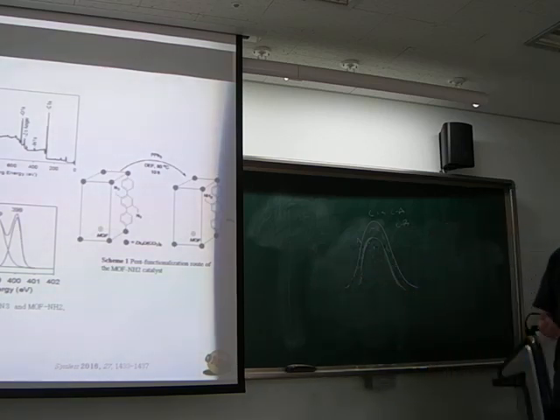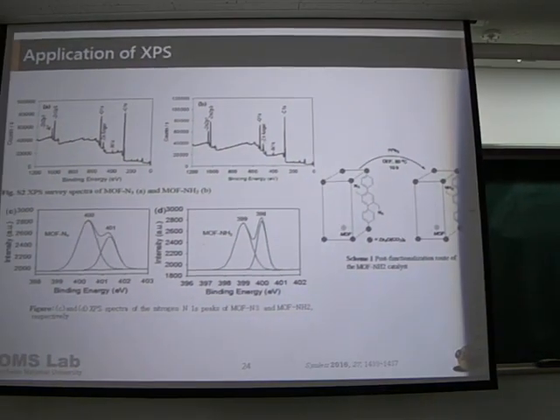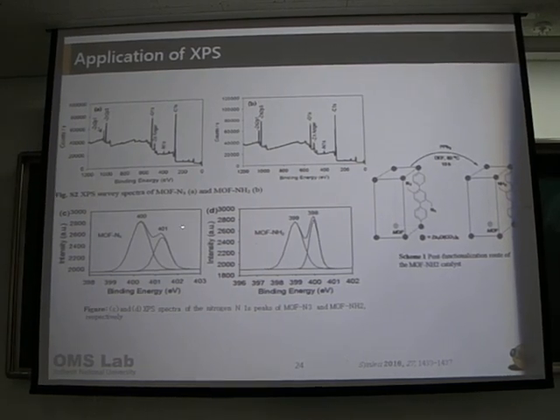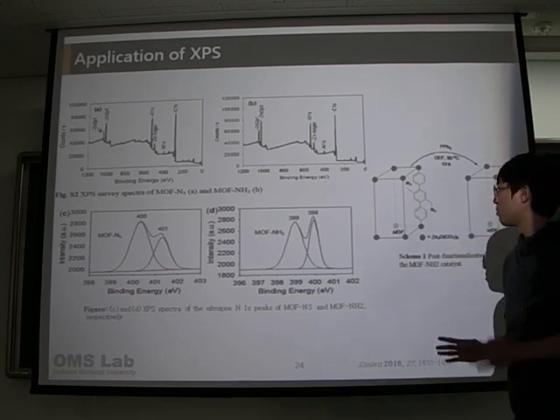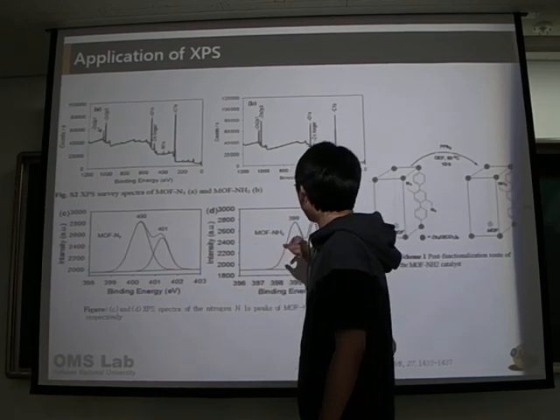그러면 NMR에서 우리가 인테그랄에서 10% 에러를 무시하는 것처럼, XPS에서는 어느 정도를 보는 거야? 그거는 제가 정확히 모르겠는데 XPS도 어느 정도 에러 범위는 있는 걸로 알고 있거든요. 그래서 절대적 비교는 안 하고 상대적 비교. 근데 그 전제 조건에는 아까 말한 것처럼 고정선을 잡아서 CC로만 해줬다는 전제를 깔아야 되겠네. 안 그러면 아예 분석이 안 되고.